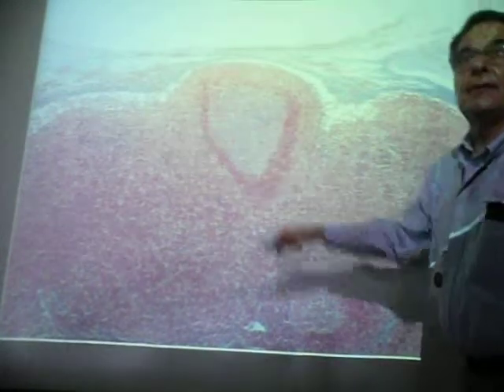There's a space just below the capsule. You can see right here. What is this called? Subcapsular sinus. And again, remember, a sinus is a cavity or space, like the sinuses in your skull. Remember, these are cavities in the bone. Okay? You'll also notice there's an extension from the capsule that projects in the interior of the organ.